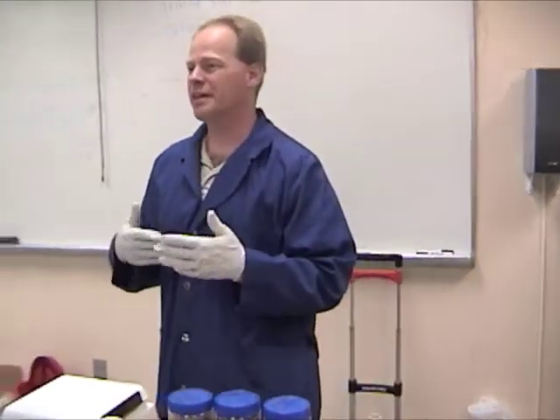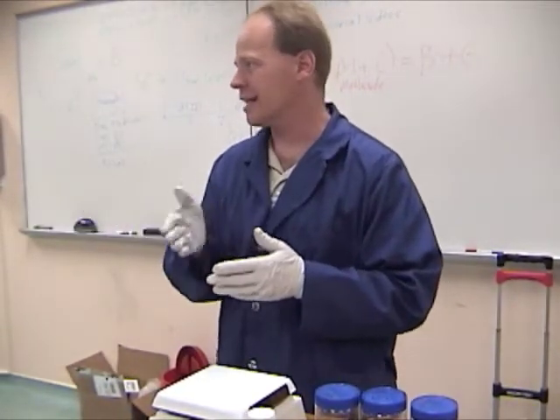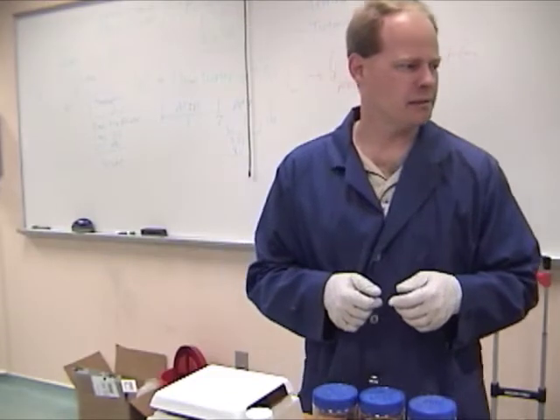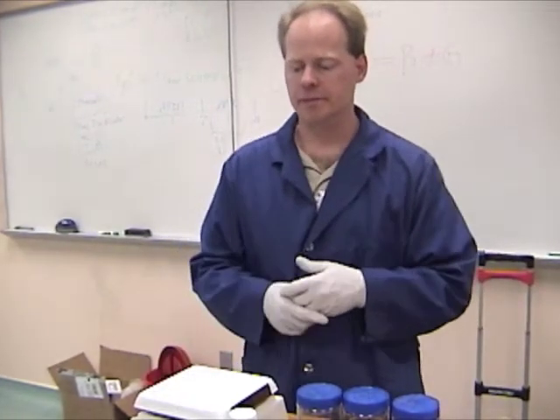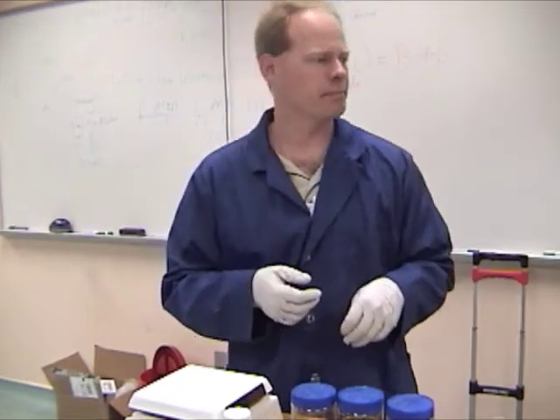We just want to know if the pH is high or low on this stuff. If it's somewhat in the basic range, we want to knock it back down. So what we're going to do is put a couple drops of phenolphthalein in here. If it turns color, hey, we know something's up.